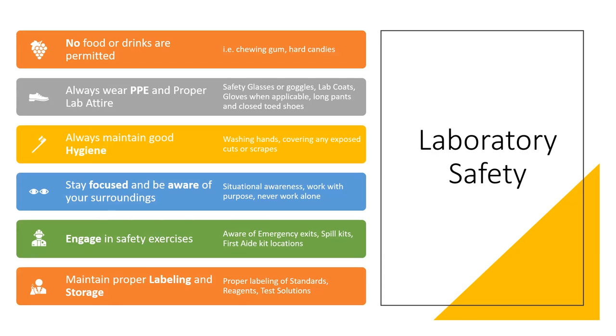So, starting out, no food or drinks are permitted in the lab. This is not allowed at any time. This could increase your exposure to hazardous materials and risk of contamination. So, no chewing gum, no hard candies, no drinks, no water, no sodas, nothing of that nature. Again, it prevents you from any contamination of anything in the lab getting into your body that is not supposed to be ingested by you.